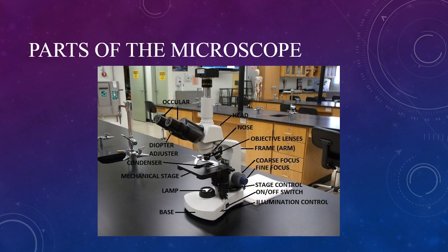Let's look at the different parts of the microscope. This particular microscope is trinocular because it has three ocular tubes. Though the center tube is usually set up with a camera, it can also be fitted with an ocular lens or eyepiece.